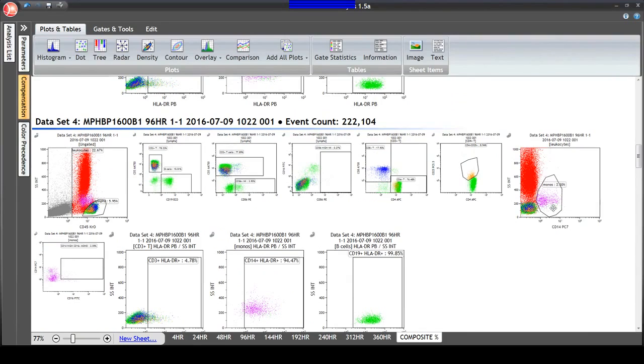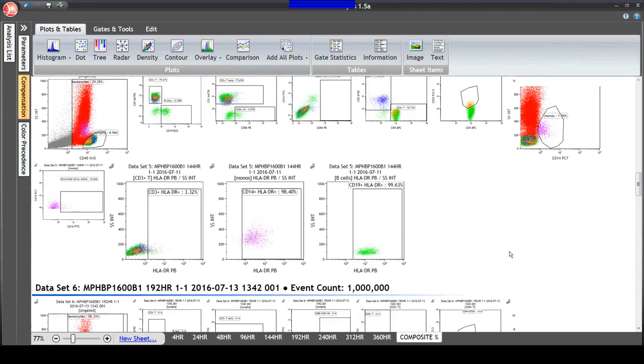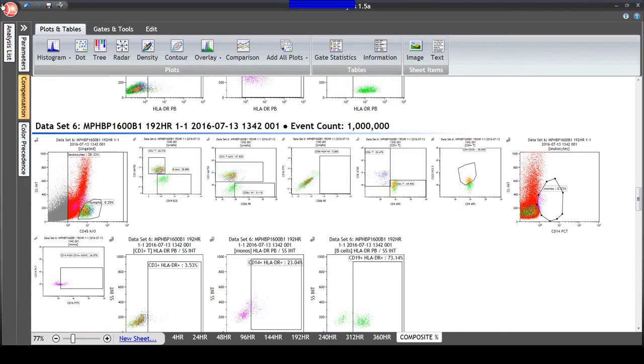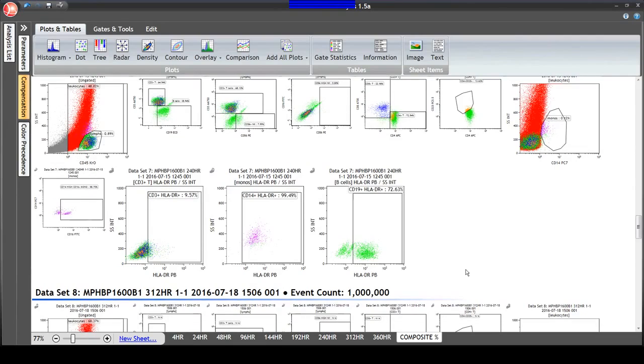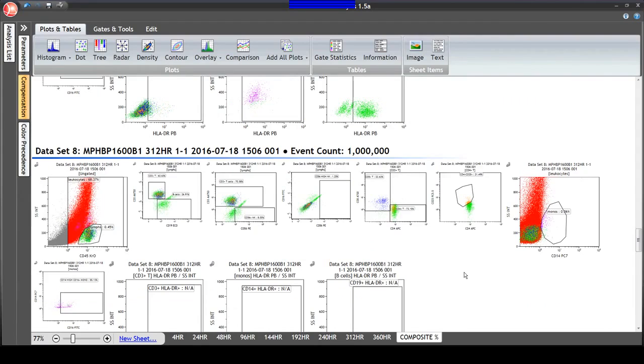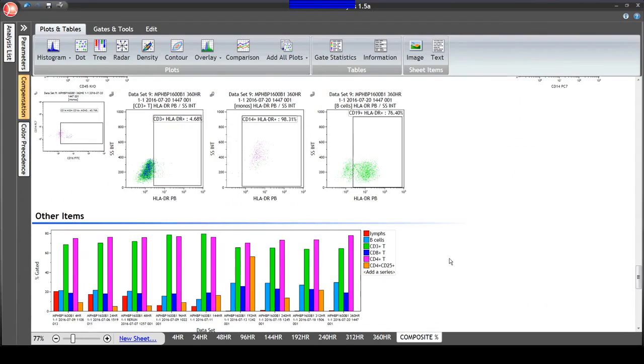Virtually 50% reduction in signal and 50% reduction in number positive. Losing them, gone. So EDTA is not the happiest place for monocytes to hang out after a couple of days. So you wouldn't want to do a monocyte study in EDTA collection because within 4 days all of your signal is gone.